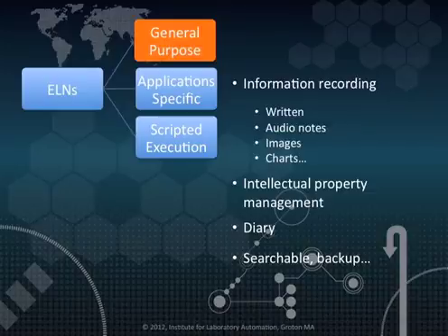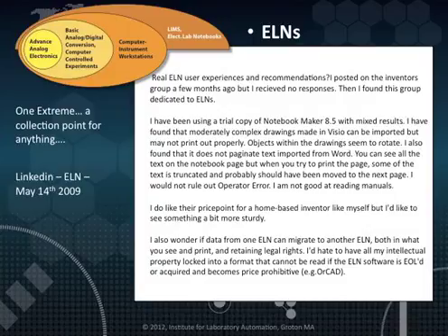As mentioned earlier, notebooks are essentially diaries and can contain written information, audio notes, images, charts, basically anything that can be put into a file. They act as a means of intellectual property management and are searchable, which provides a major advance over their paper predecessors. In addition, since they are in electronic form, they can be easily backed up and as a result preserved against loss. As you can see from this request, people's requirements for laboratory notebook products can range from the very simple to the very complex.